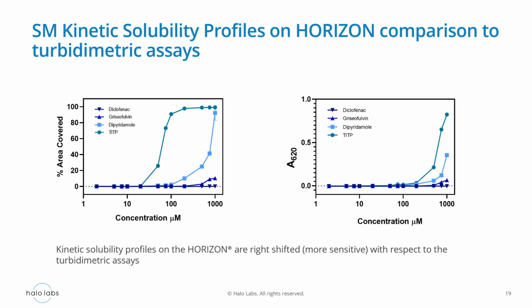And that's how you can become more sensitive. And as you can see, this methodology was able to give us a better range of concentration usefulness for each of these compounds, although the order was the same.